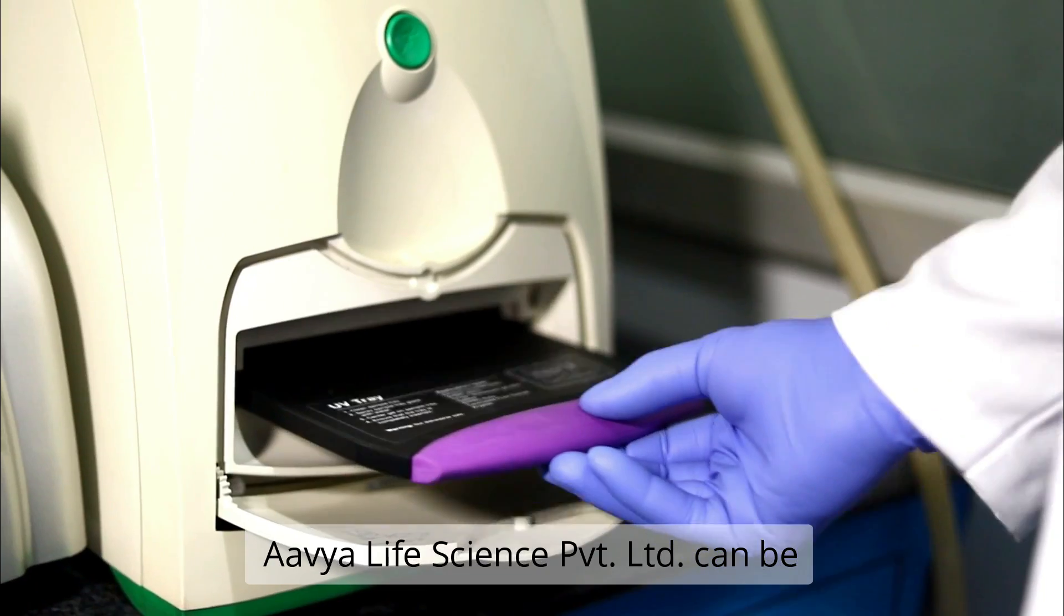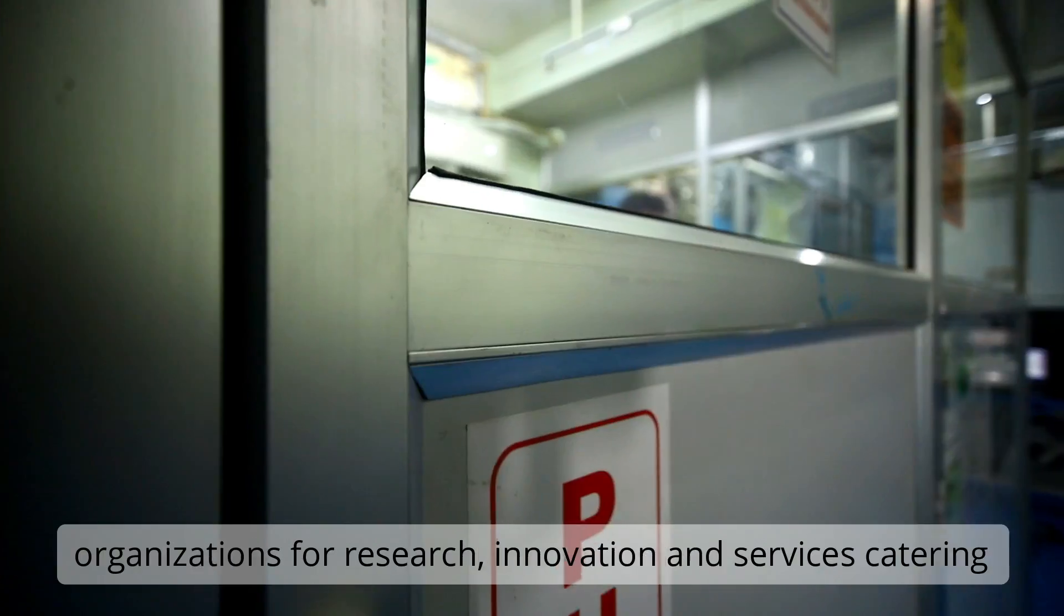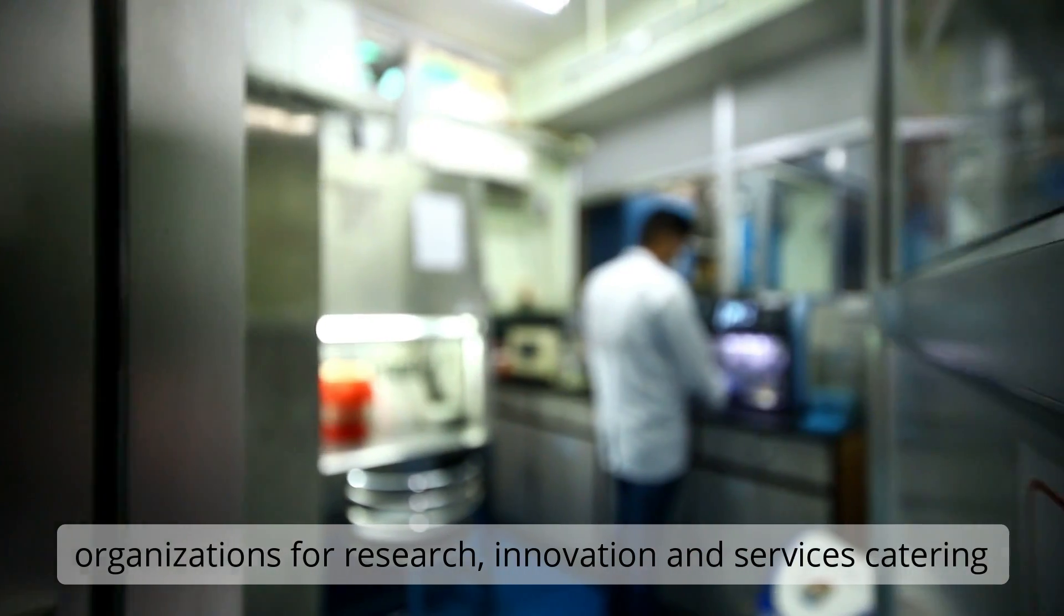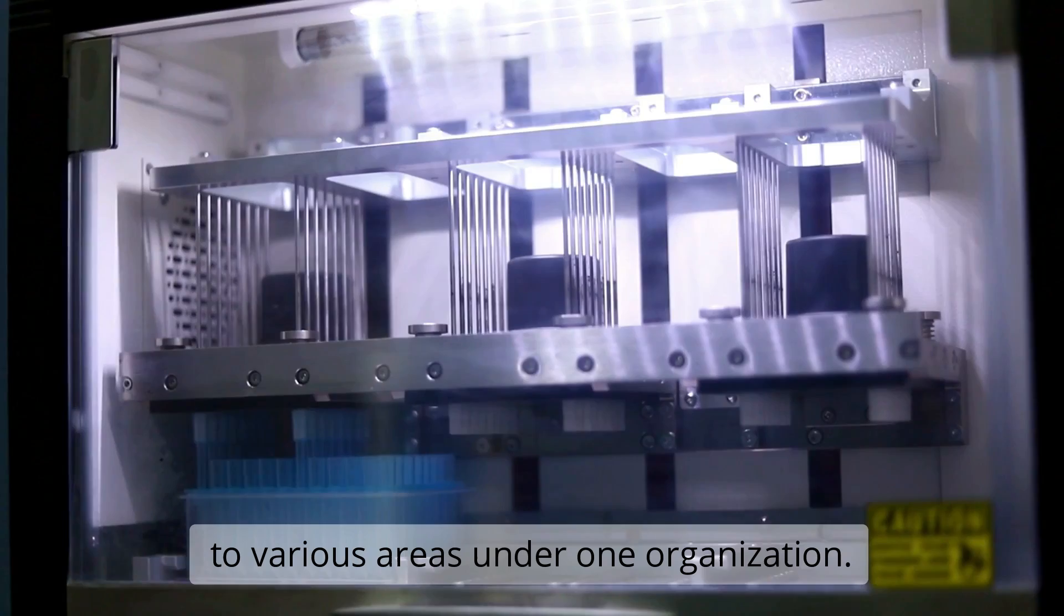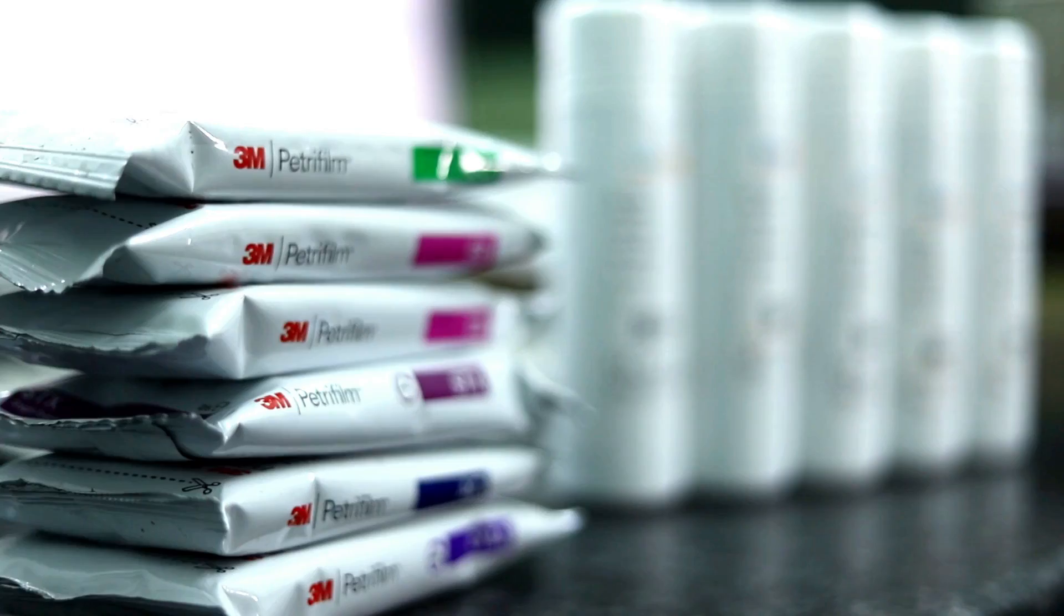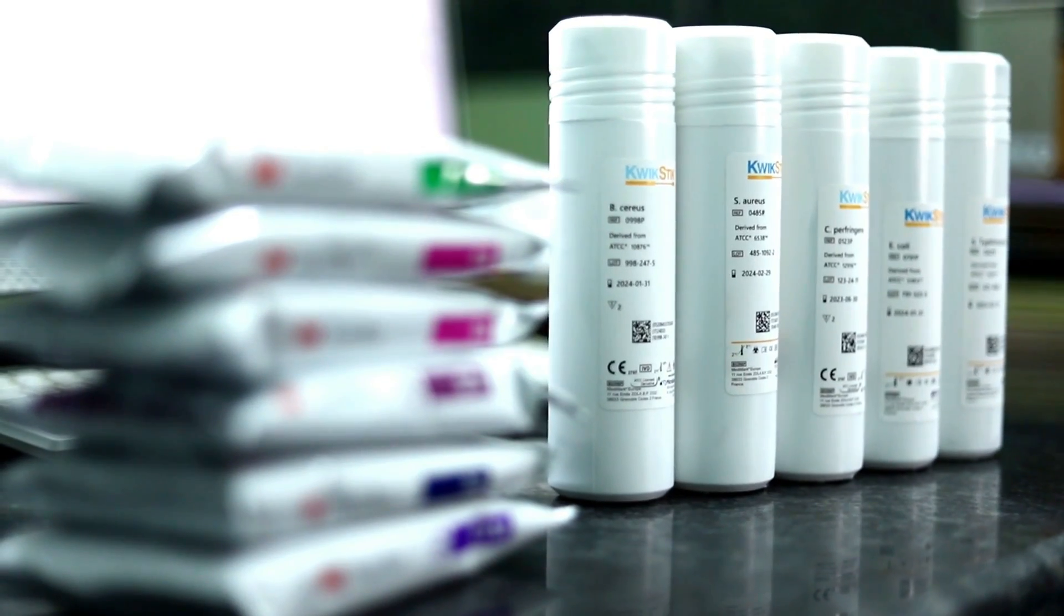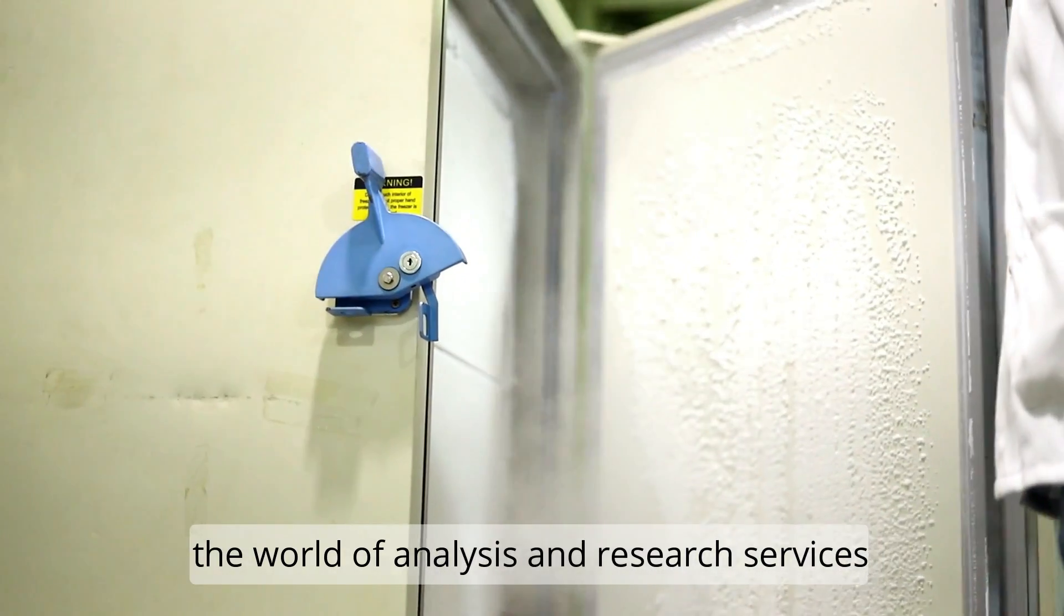Avia LifeScience Private Limited can be called one of the most reliable growing organizations for research, innovation, and services catering to various areas under one organization. This makes us the first choice in the world of analysis and research services.